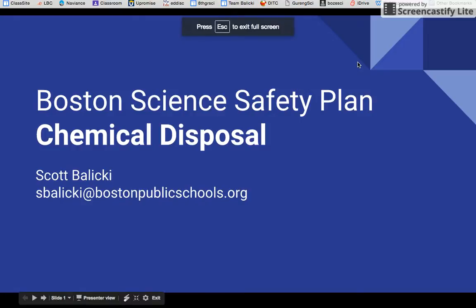I'm a chemistry teacher at Boston Latin School, and in this screencast, I'm going to detail hazardous waste disposal methods in accordance with the Boston Public Schools Science Safety Plan.